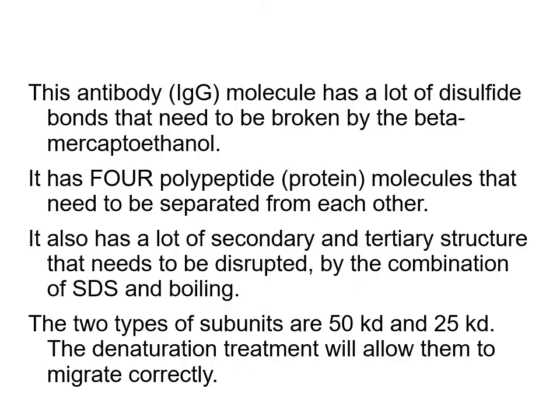All right. This is what I just said. So the denaturation treatment will allow them to run correctly according to their subunits, which, reminding you, are 50 kilodaltons and 25 kilodaltons.